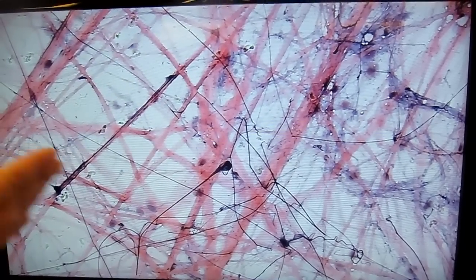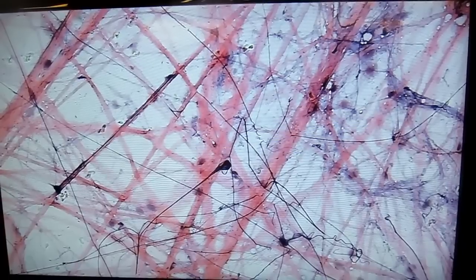And that extracellular matrix is broken down into the fibers, which you can see here, and the ground substance, which was the material that was filling the spaces between the cells and the fibers in the specimen.